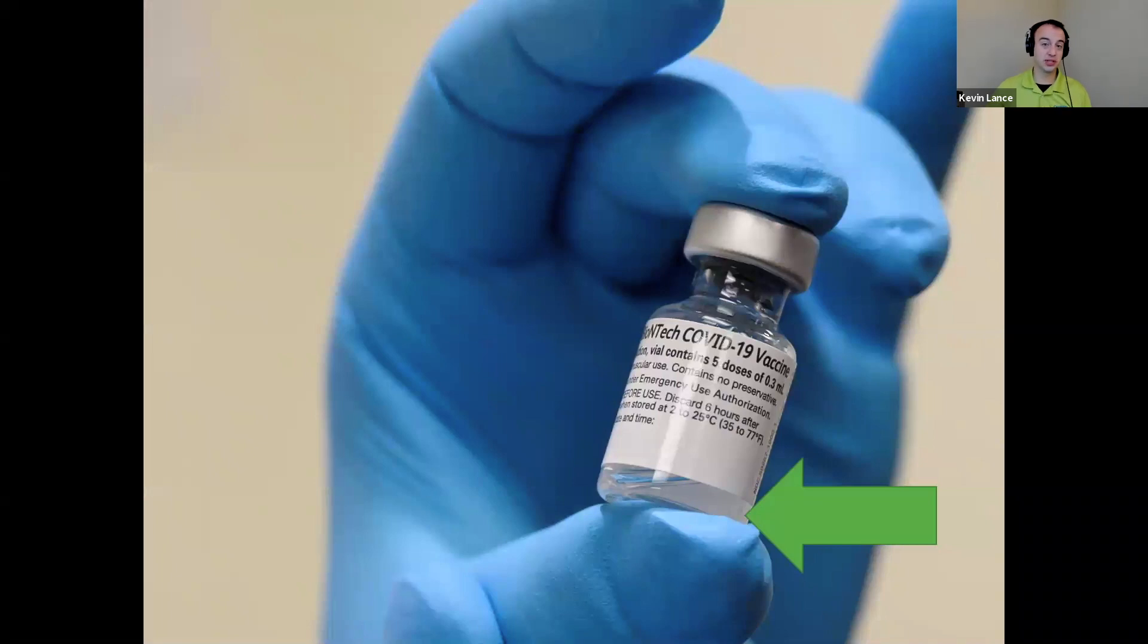So time to switch gears to UV-Vis. Here we're looking at a vial of RNA LNP COVID-19 vaccine and the green arrow points out the liquid in the vial. Anytime you try to see through solutions that are cloudy, absorbance measurements done with plain vanilla instrumentation will have some issues to overcome.